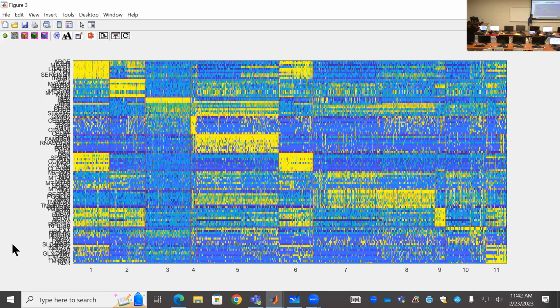So for example, cluster 7 contains more cells, so you have a wider space here. Assume those genes are the marker genes, but some of these marker genes are not so specific. For example, for those, it's also expressed in cluster 1 and 6, right? Some are okay. But after that, you can look at the gene name and pick manually.